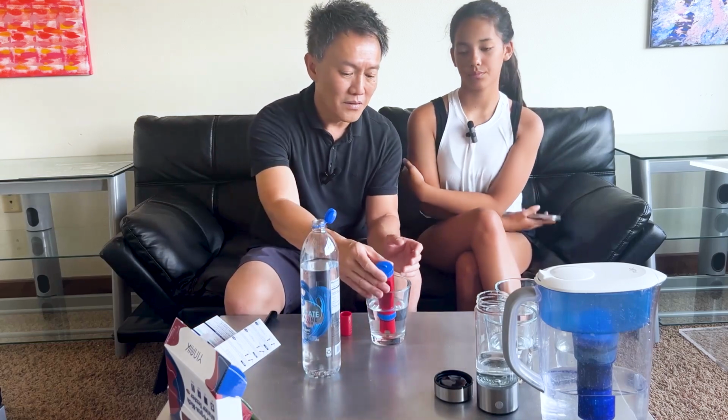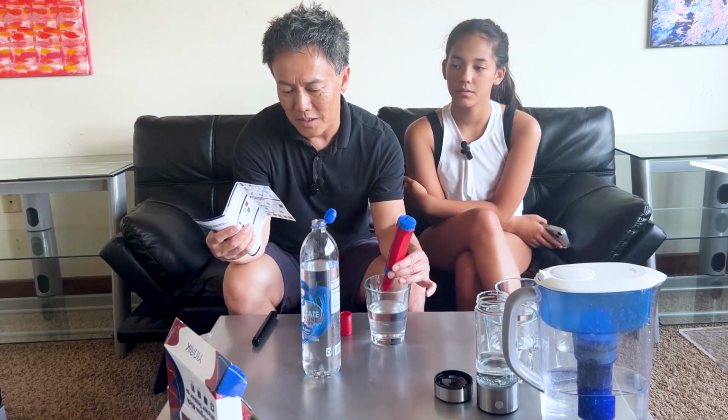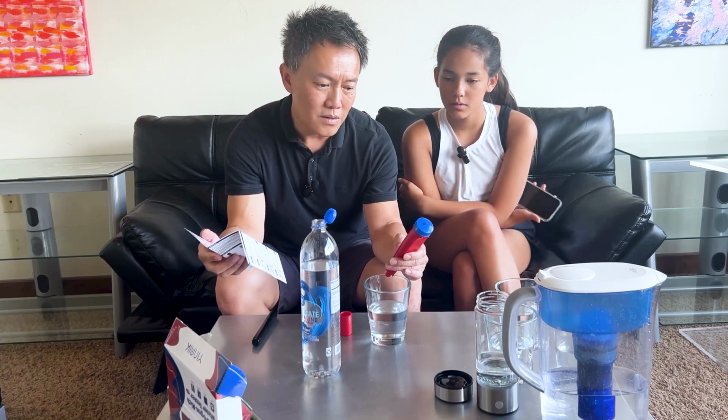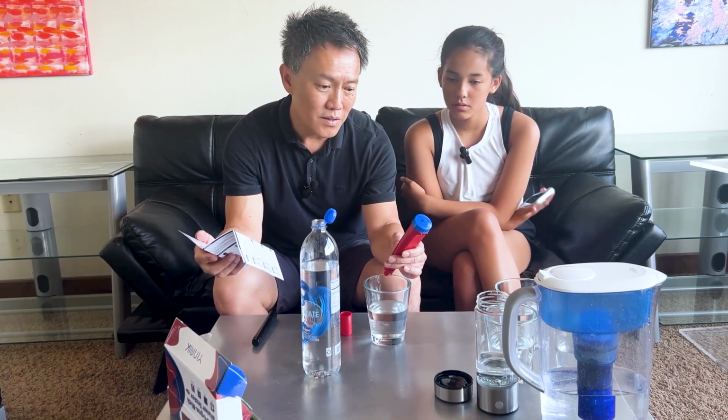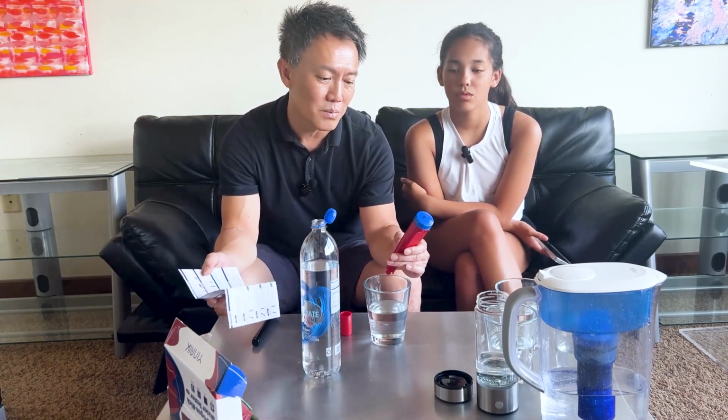I have no idea. On this, there are other settings. Other things you could read. Gosh, I have to do some more research, but there's a ppb reading, there's a ppm reading, and there's an mV reading, with a lowercase m and capital V, which I don't know what it means. It also tells the temperature, which is kind of cool.